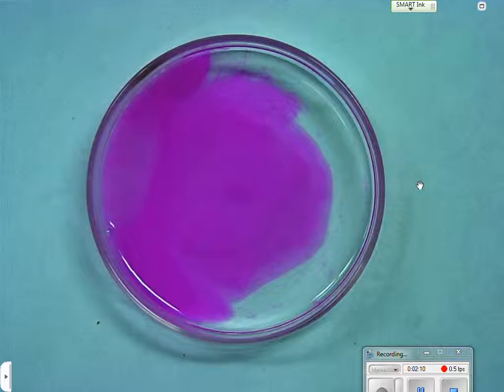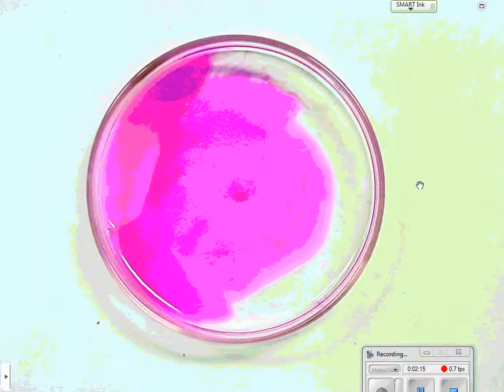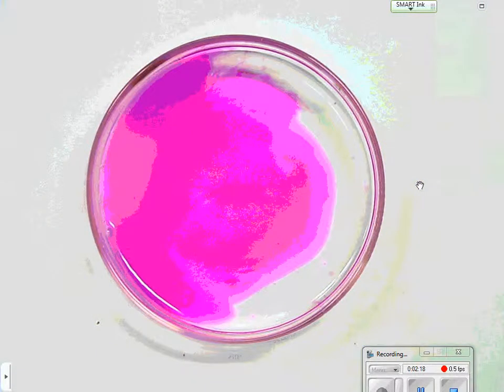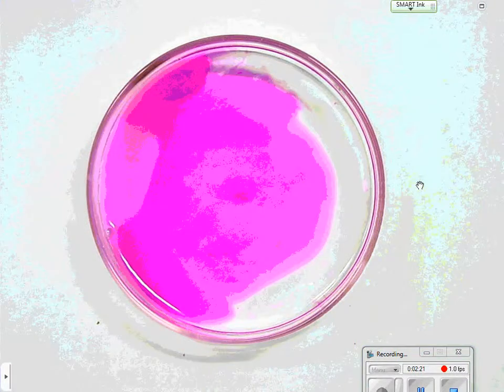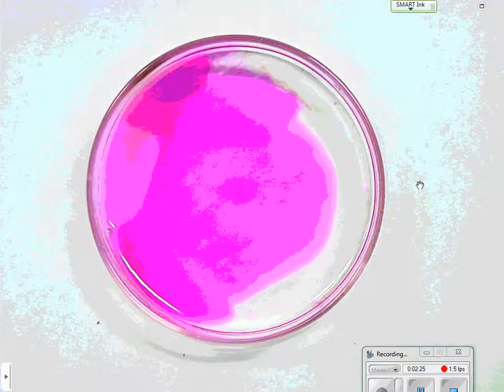And you can see that that stuff is spreading out everywhere. Okay. And... Wow. That piece of calcium is all gone. But it's not gone. Where is it? It's in the water. Right.